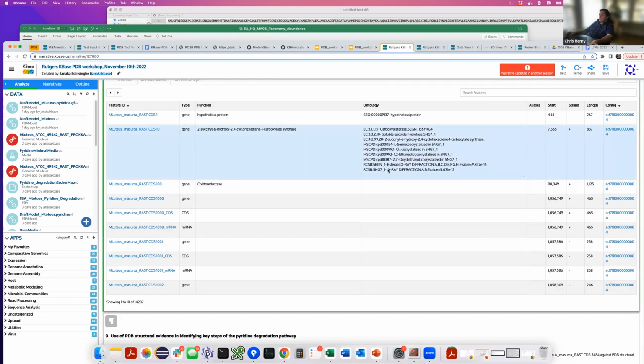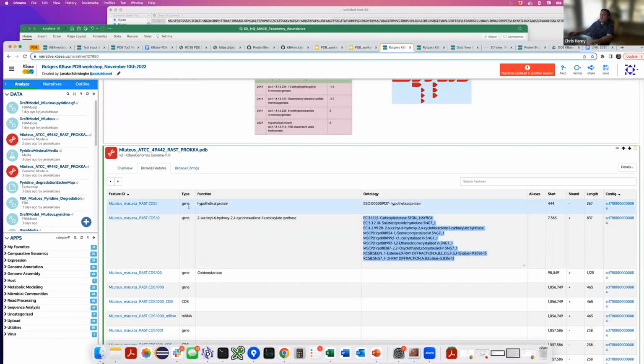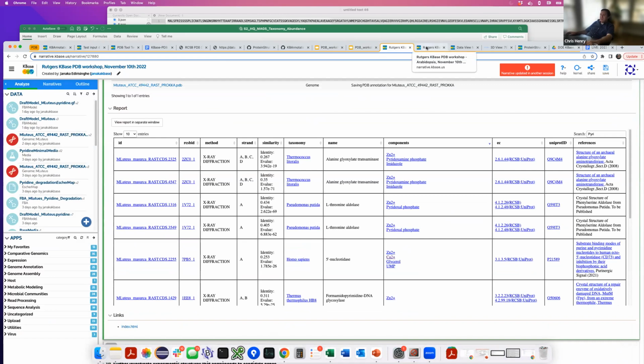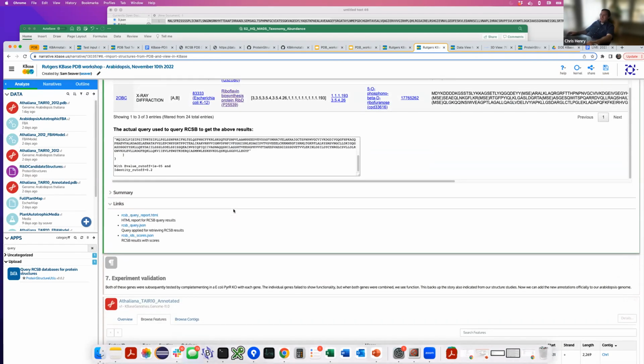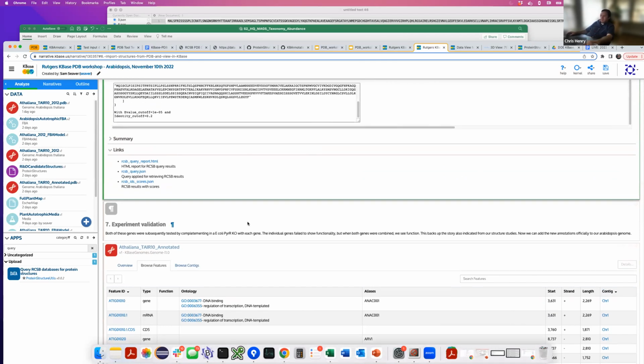And I'm thinking about the third-party developers among you: know that you have this data at your fingertips to do stuff with. There are tons of integrations that are powered by having this data available. I think the last thing I wanted to mention is the punchline of the Arabidopsis story. The punchline, from the study that Brenda did with the alignment, is that the two proteins in Arabidopsis actually align to two different parts of the E. coli gene that does the RIBD function.